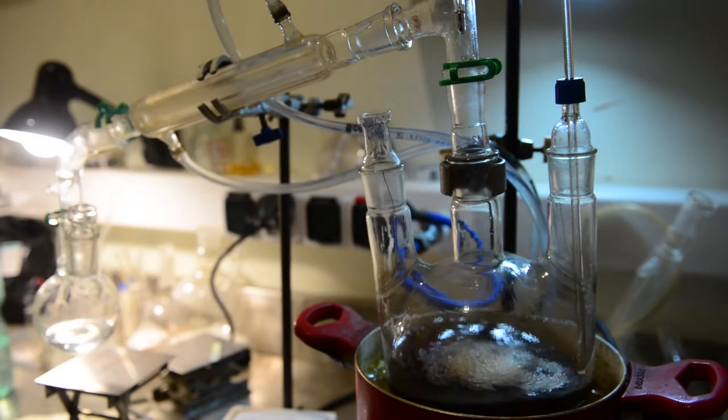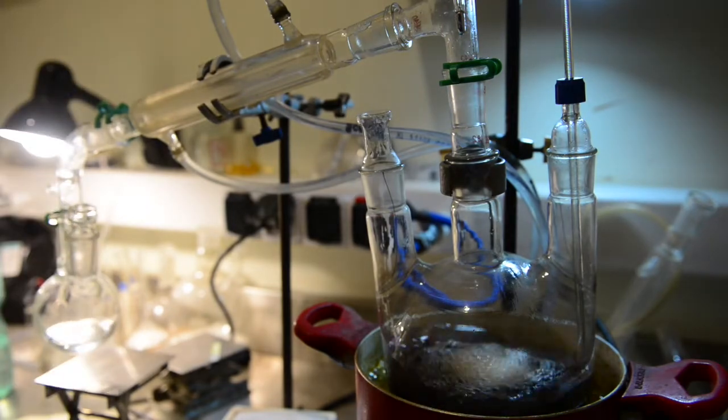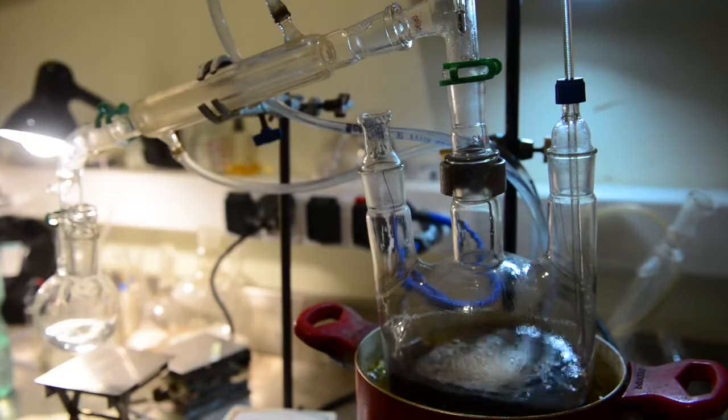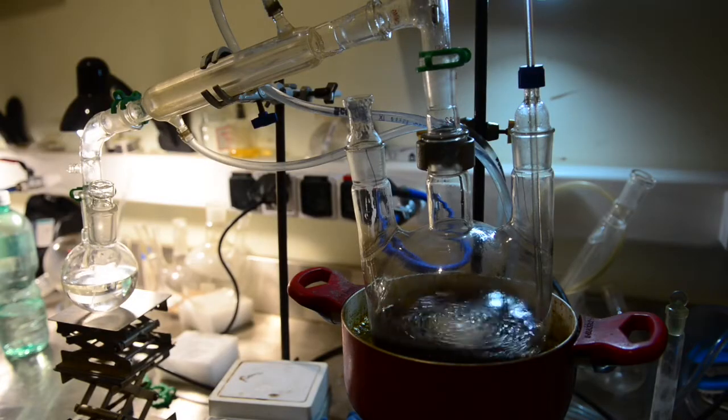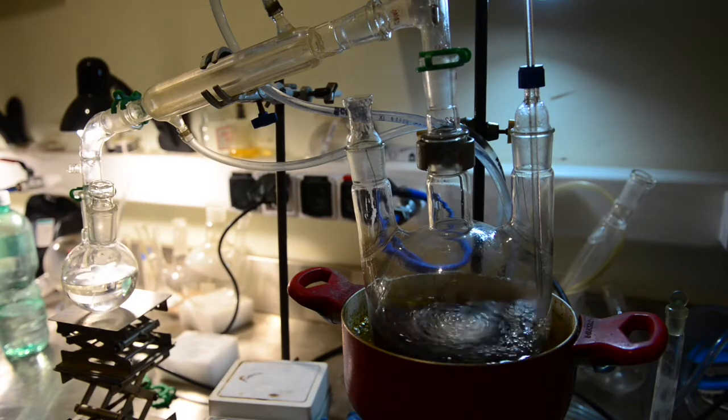Allyl alcohol forms a water azeotrope with a boiling temperature of 88 degrees Celsius. I have decided to collect the fraction coming over from 85 to 99 degrees and then dry collected liquid with calcium chloride. We don't need dry absolute alcohol for our next reaction step, but I was interested in how calcium chloride works and decided to perform further drying steps.